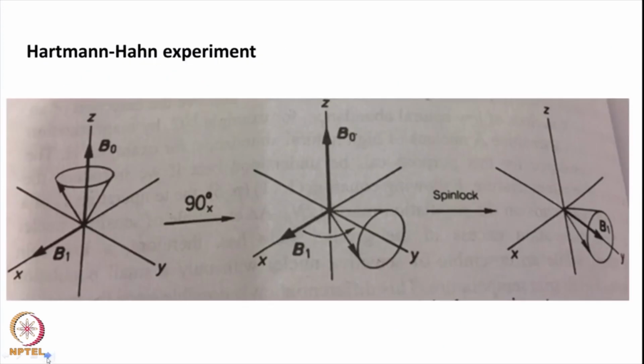Okay. So, essentially, vectorially, if you see it, here is our B0 field. To start with, we had magnetization in the B0 field in the Z direction, and here is our B1 field, which is in the transverse direction. We applied a 90-degree pulse, say an x pulse. Now our spin is in this direction and rotating in the xy plane.